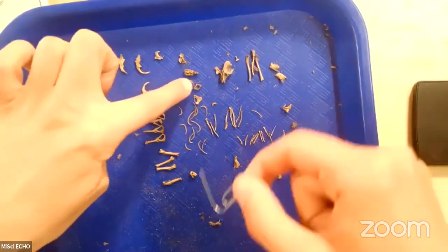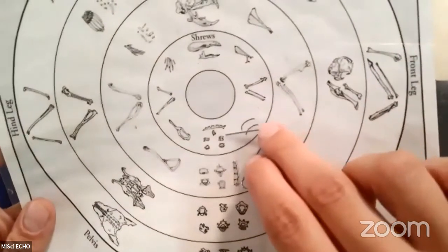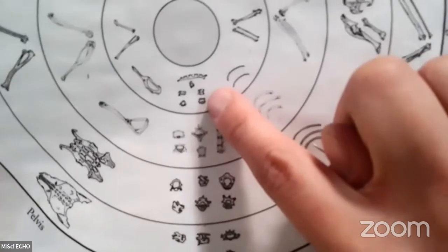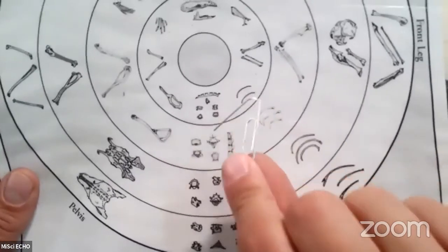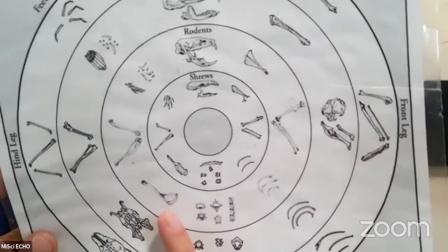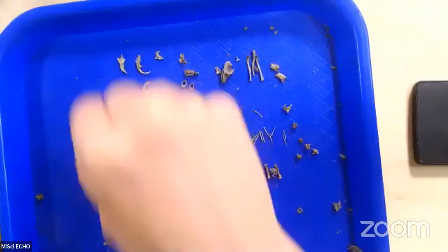And then I've got totally different vertebrae over here, which come from a different type of organism. So based on my chart, I would say that those smaller ones came from a shrew. Very, very tiny, look just like this in the diagram if we could see it way up close. But those other vertebrae look more similar to the rodents. So we can see that there were at least 2 rodents consumed based on the number of rodent pelvic bones we found. But there also seems to be pieces of a shrew skeleton inside this one owl pellet.